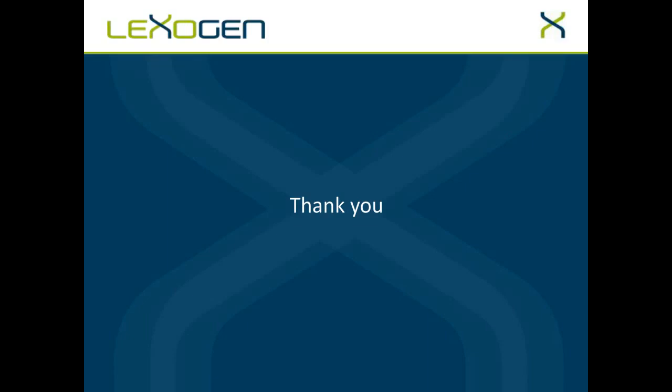Okay, let's see. We have so many great questions coming in. Have you used SIRVs to benchmark transcript assembly tools? If so, what did you find? Actually, we ourselves have not done that, but I cannot exclude that many of our SIRV customers or test partners have done that already, and it would be a really good application for the SIRVs.